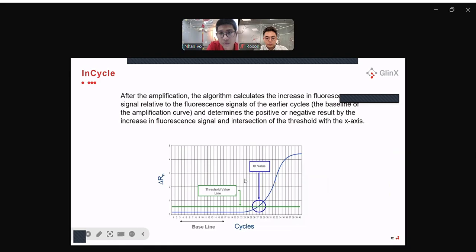In the last training we conducted, we mentioned a really crucial step: we adjust the threshold, right? So the machine reads the results by what? Do you remember that?